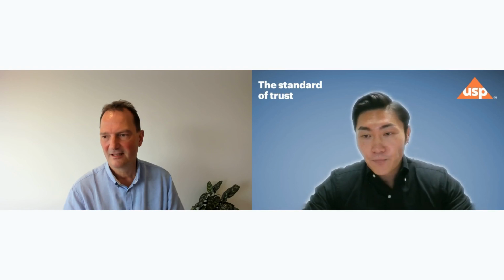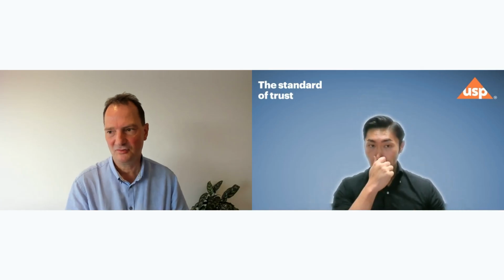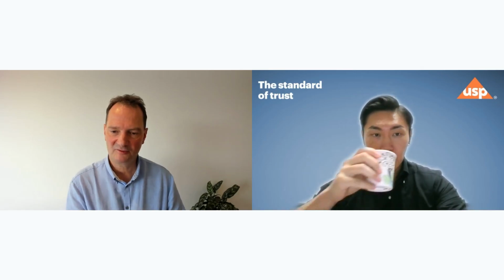Mm-hmm. Then we have some questions on the potential impact of this chapter and the new standard. So I think the first question is, clearly the chapter is written by a group of real experts in this field, so what's the FDA liaison's role in writing the chapter? They're just observers on the panel. For all our expert panels, we always have government liaisons.